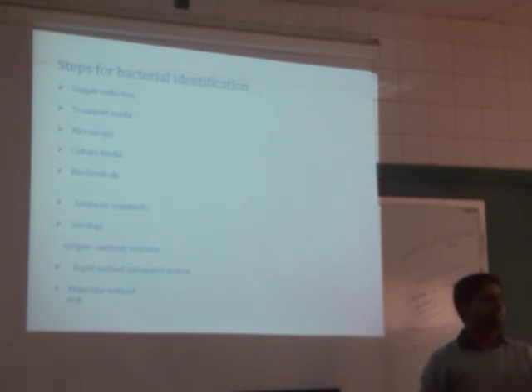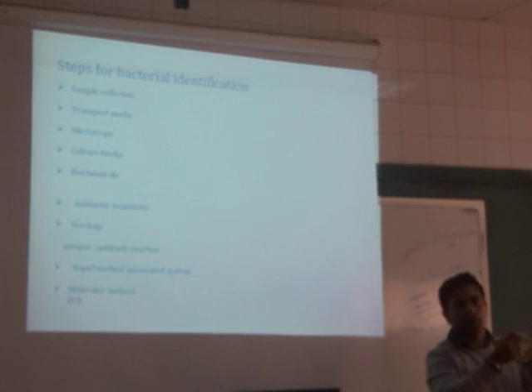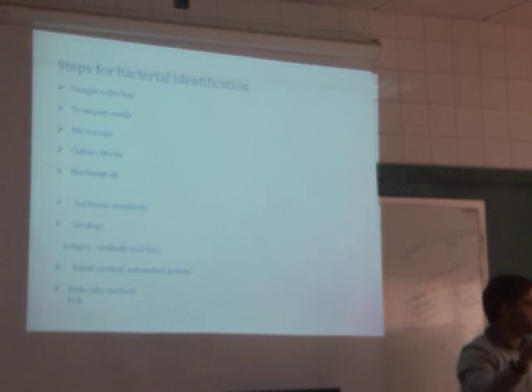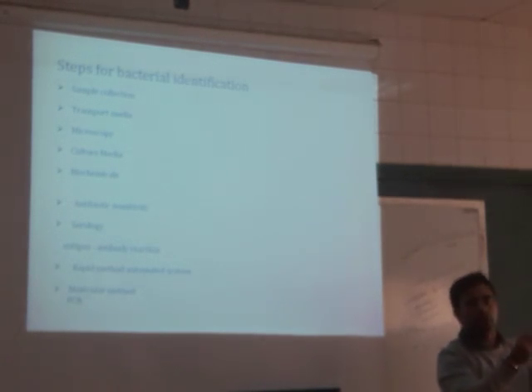After 24 hours we see which antibiotic kills the microbe and which does not. If the antibiotic is sensitive, it will not allow the bacteria to grow. It will fall in the clear zone. If the antibiotic is not effective against the microbe, the microbe grows and it will not show any kind of effect.